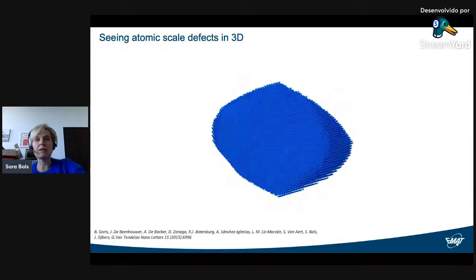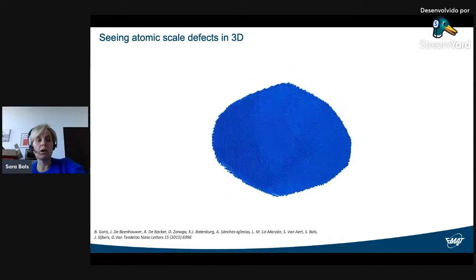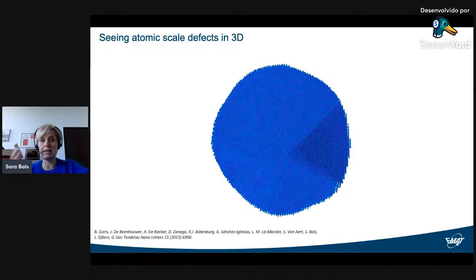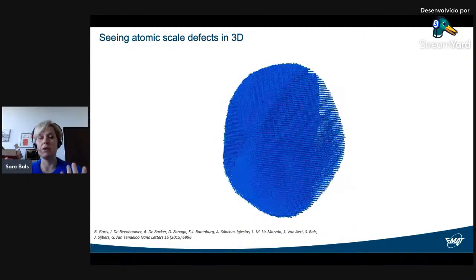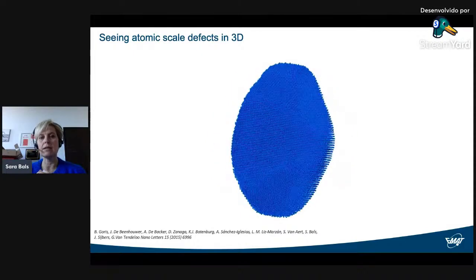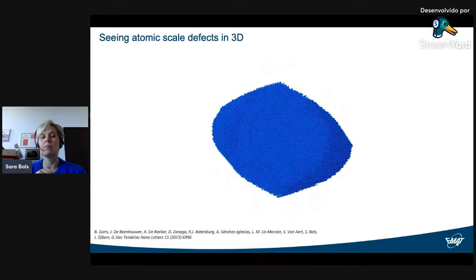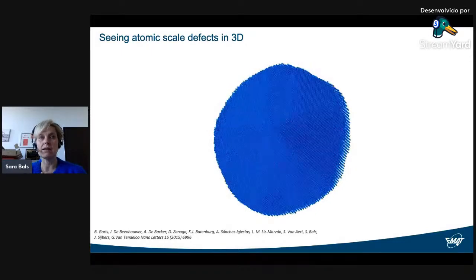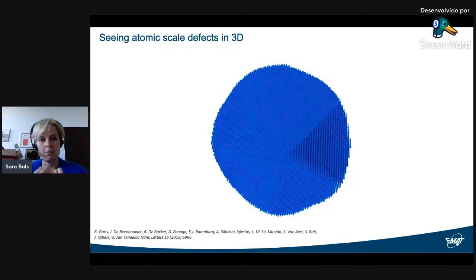And you can understand this because, mathematically speaking, this is simply an ill-posed problem. You have way more unknowns than you have equations, in this case, than you have experimental data. So in order to obtain a reconstruction such as this one here, we very often are going to use constraints or prior information that we have available on the system. So in this case, we assume that every atom can be modeled as a three-dimensional Gaussian distribution. And because we can make that assumption, which is a fair assumption, the inverse problem becomes sparse. So that means that it's easier to solve.